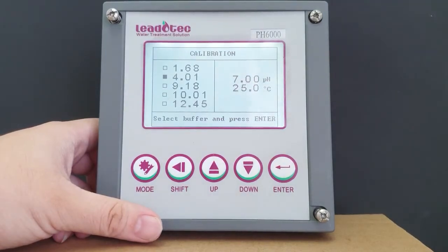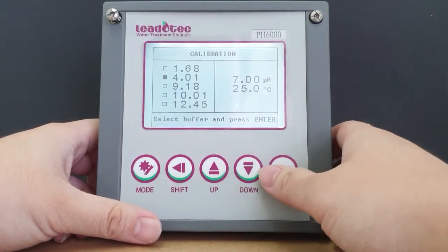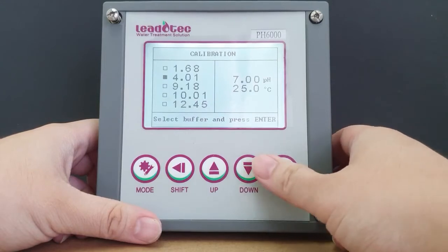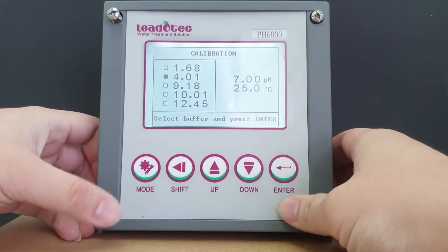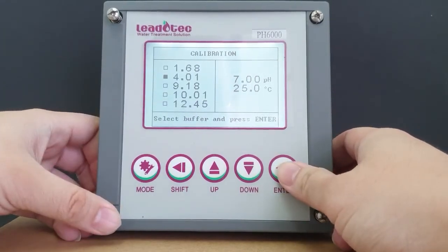Now I'm going to rinse off the sensor and immerse it in a pH 4 buffer, 4.01. So now that the cursor is at 4.01, I'm going to press enter to proceed.